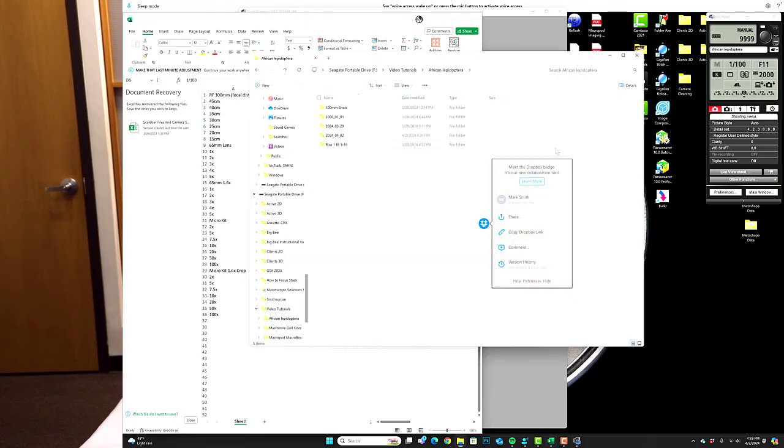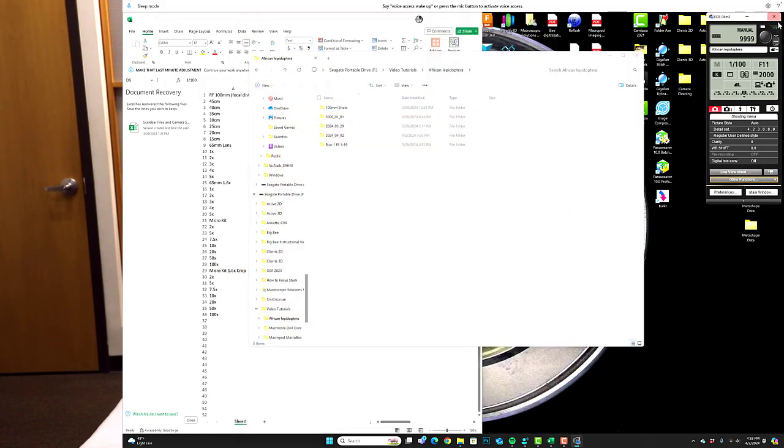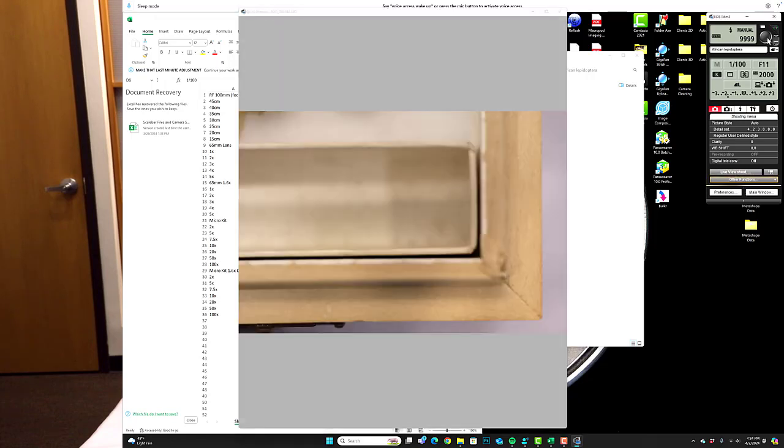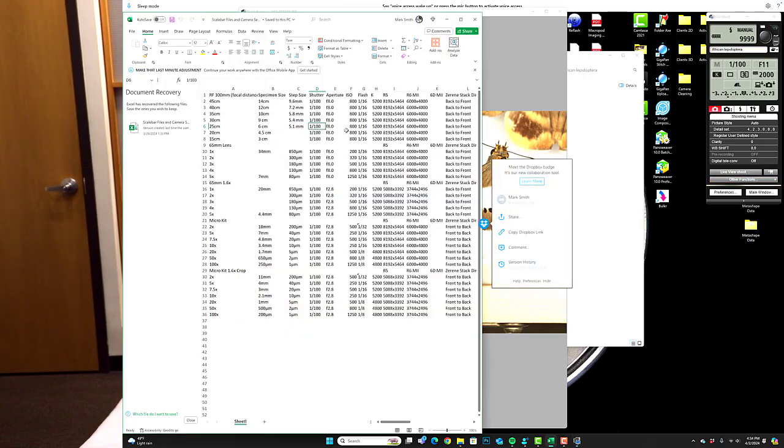What we can do now is actually take a couple of test images. So open up a quick preview. Quick preview is under other functions. Quick preview, we're going to take a test picture. Actually, that brightness looks fantastic. So I'm also just going to modify that here in the table. I don't think I adjusted the ISO levels, so I'll make sure that these ISO levels are accurate. However, basically these are starting point parameters. I just want to clarify that.